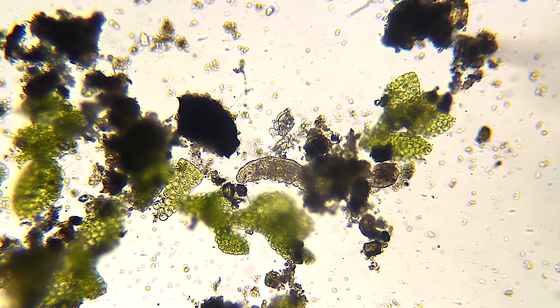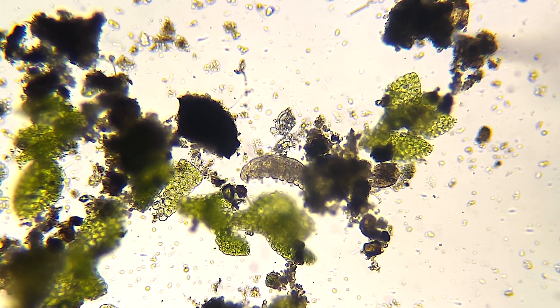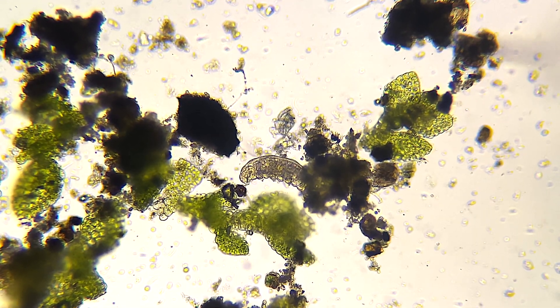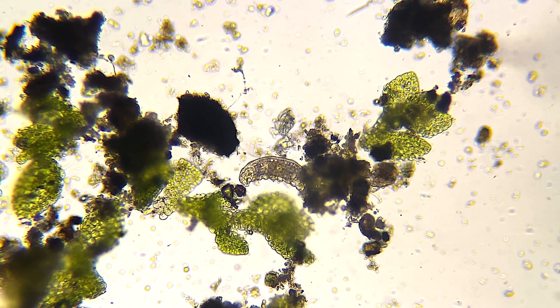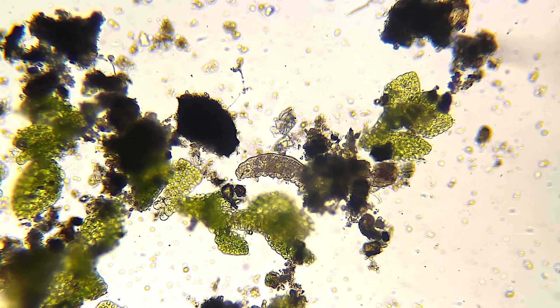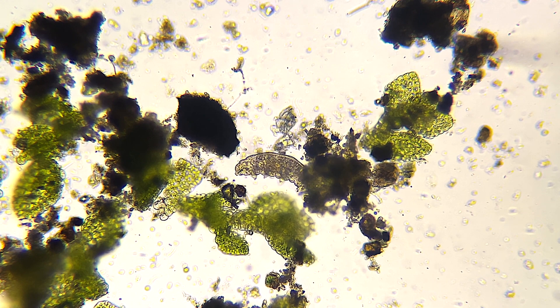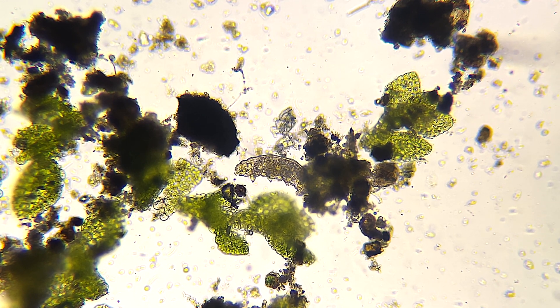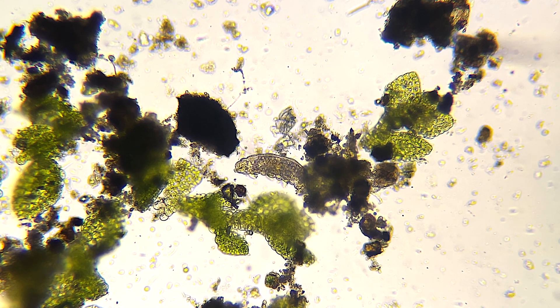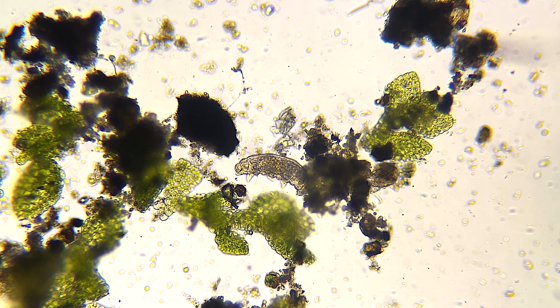I got this water bear out of some moss and it took me a while to find him, but when I finally found him and got him in my pipette he didn't move for about a good 10 minutes. I don't know if he was stunned because I sucked him up into a pipette, I'm just not sure.